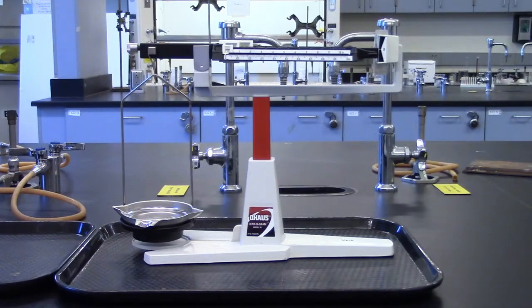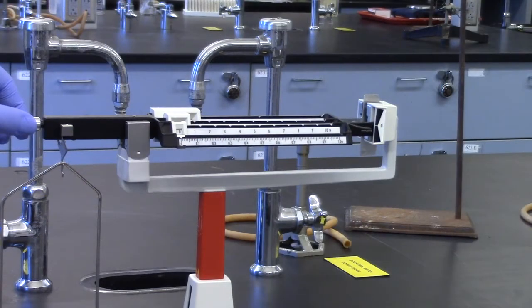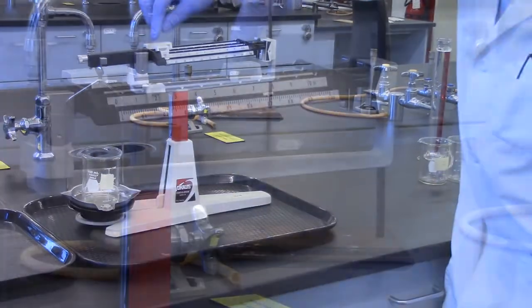A quadruple beam balance will be used to measure all masses to the nearest 0.01 grams. Use the same balance throughout the entire experiment to cancel out systematic errors, which you learned about in the measurements experiment. Record the number of the balance, place it in an area with minimal effect from the vents, then zero your balance. Weigh a clean, dry, labeled 100 mL beaker and record the mass.